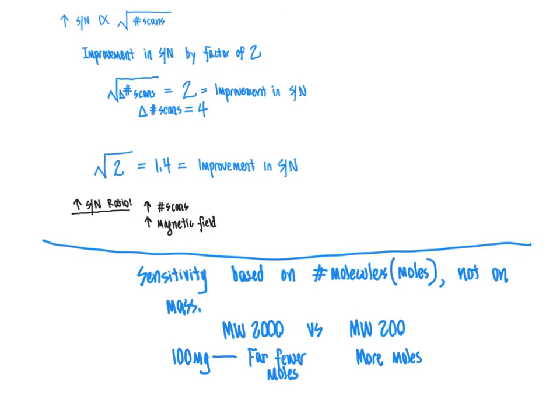And so that's one reason why the evaluation of proteins is extremely challenging in some cases by NMR, because those are very high molecular weight compounds. That makes protein NMR more complicated, in addition to the fact that there is such a large number of atoms in a protein, making the NMR spectrum very complex as well. So what we will do in the next several videos is dive into the application of NMR data in both 1D and 2D modes to determine the structures of unknowns, a very powerful technique for evaluating compounds of biological relevance.